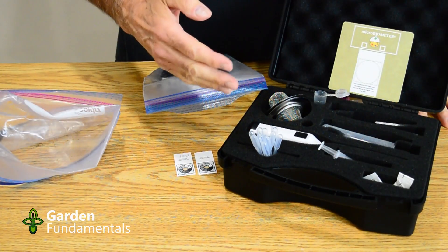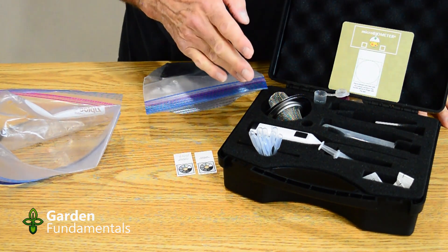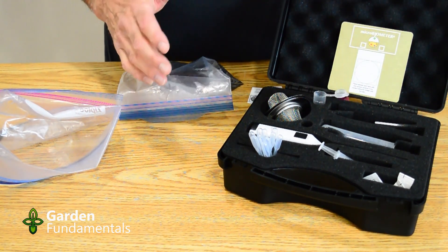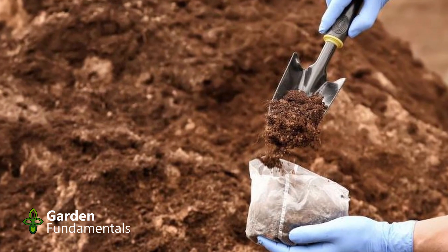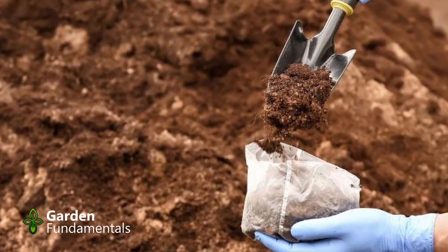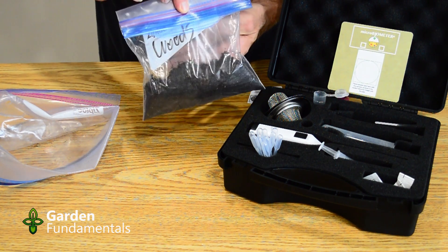I'm going to compare the result of the kit to lab tests, and then I'll introduce some tests that I've done to check the accuracy and repeatability of this kit. The test kit comes in a nice carrying case and it includes everything you would need except some water and a soil sample. First thing to do is to go to the garden and get yourself a soil sample, and how you collect that is important.